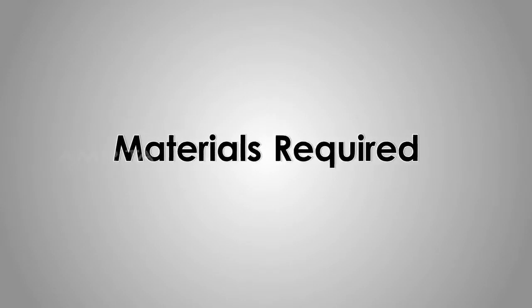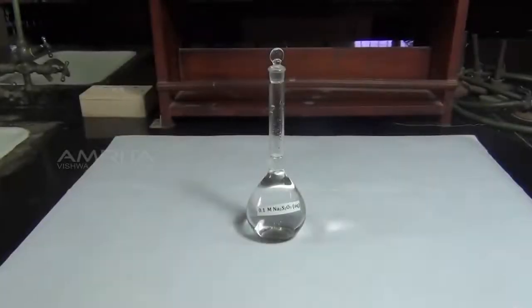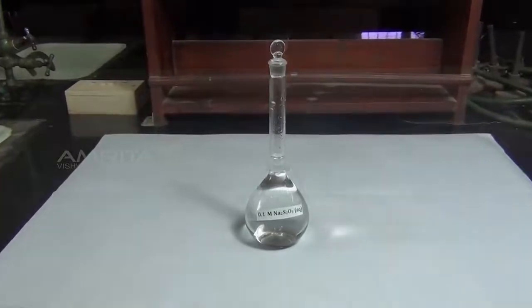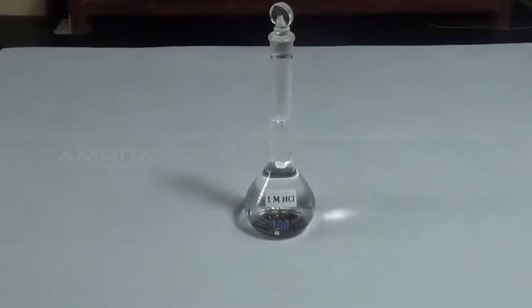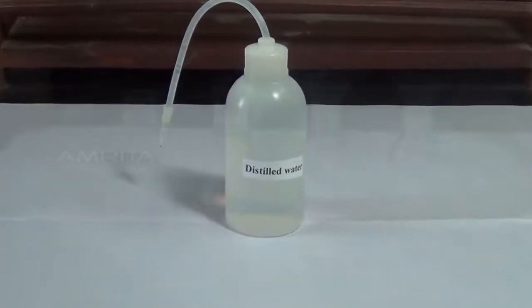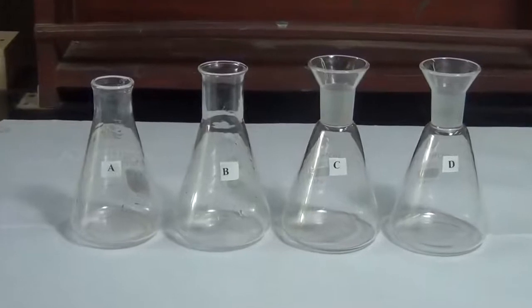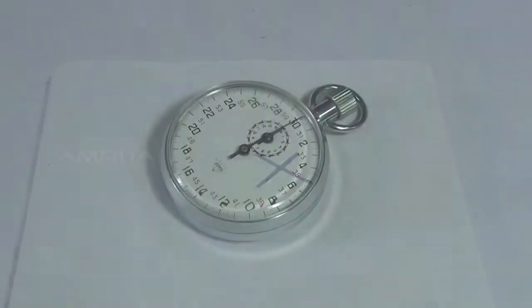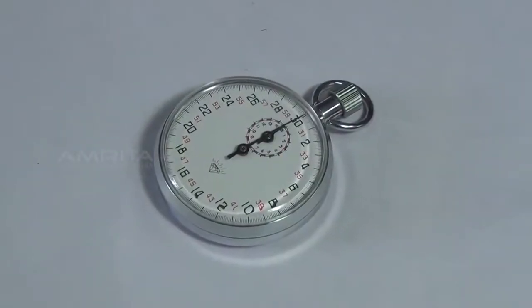Materials required: 0.1 molar sodium thiosulfate solution, 1 molar hydrochloric acid, distilled water, conical flasks, measuring jar, tile with a cross mark, stopwatch, etc.